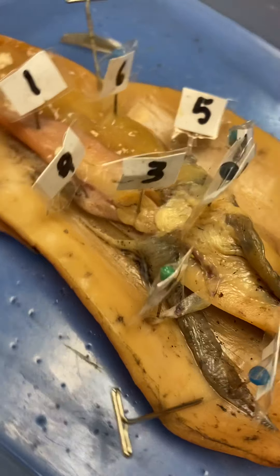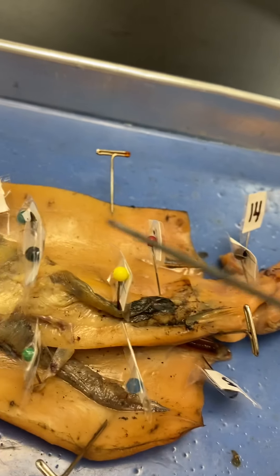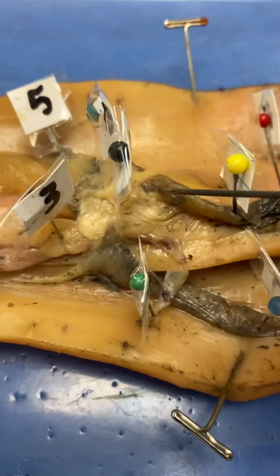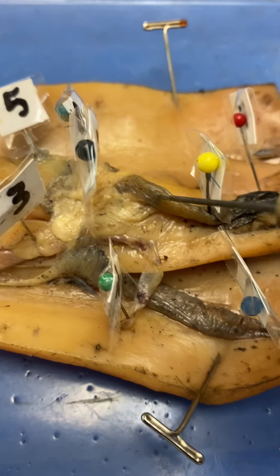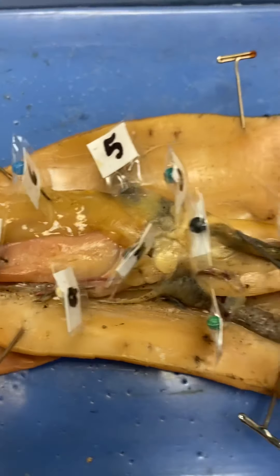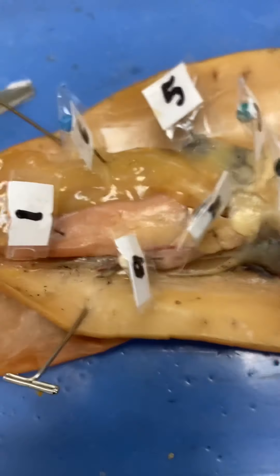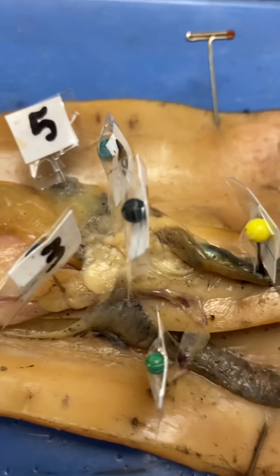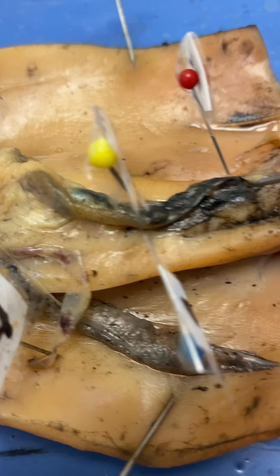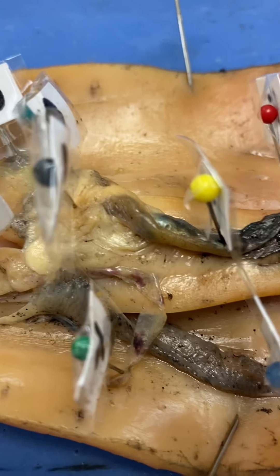The stomach is labeled number five and the cecum is number six. Right in the middle, number seven, is the systemic heart. And then number eight, you can see this little circle structure — that circle structure is the branchial hearts. It's the systemic heart in the middle and the branchial hearts are the little circular ones on the side.